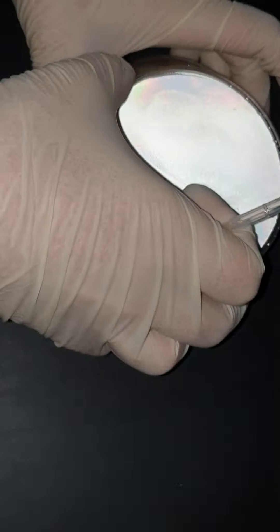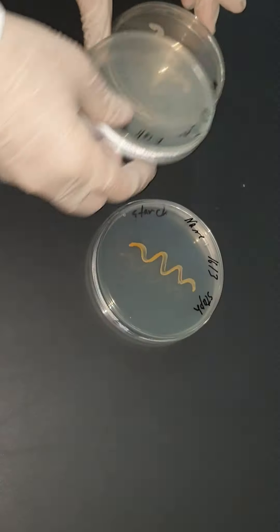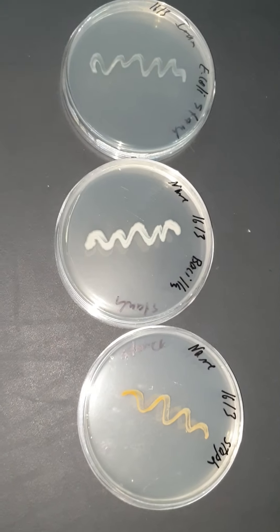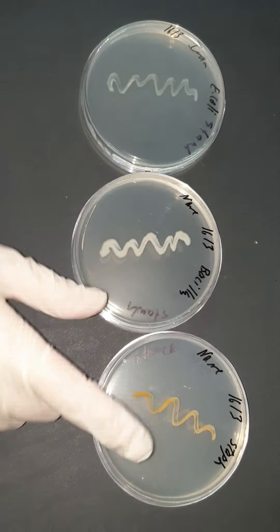In the next test, I will show you the results of starch hydrolysis. This is the growth of my bacterial cultures on starch petri dishes — E. coli, Bacillus, and Staphylococcus are all growing nicely on starch petri dishes.